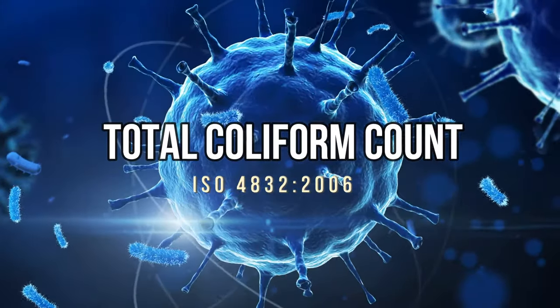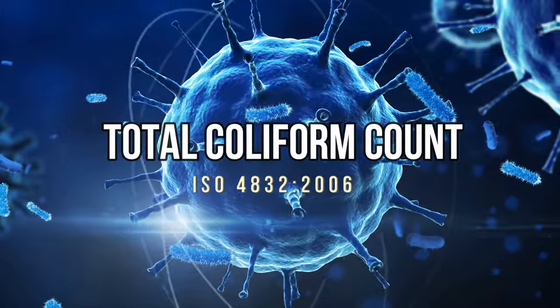Hello viewers, today we are going to test a wastewater sample for total coliform count.